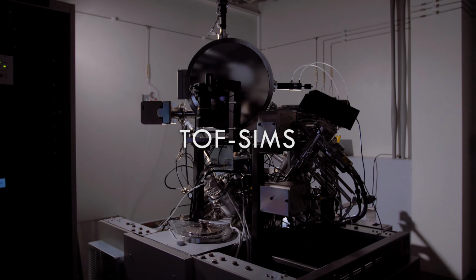It is very important that the material which is going to be analysed is brought into the laboratory the proper way, because ToF-SIMS is sensitive to the outermost 1 or 2 molecular layers. To avoid improper results, the material needs to be held in a container that contains no other residue other than the material itself. Even volatile substances can cause sample contamination.